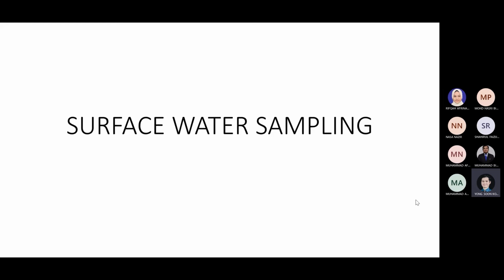I think pollutant may not be the right word because, in fact, one of the important parameters that we would determine from water samples is pH, for example. They're not considered pollutants, but we determine them all the time.